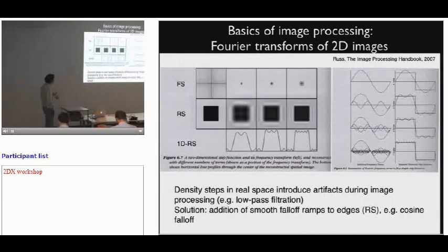Now we're moving on to another situation, like this squared binary rectangle. And we are trying to understand how you can actually illustrate such a rectangle with the help of these different cosine functions. One way of doing this is to mask out in Fourier space. You compute a Fourier transform, and then you mask out all the higher frequencies. What you end up with is a rather cosine-looking rectangle.